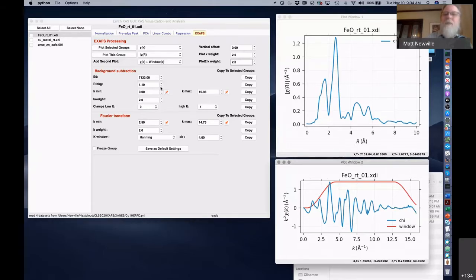And now as I change this background function, in fact, I'll go back to setting this background function to 0.01, and you can see actually that what happened is that there's all of this structure. Actually it looks pretty good, doesn't it?